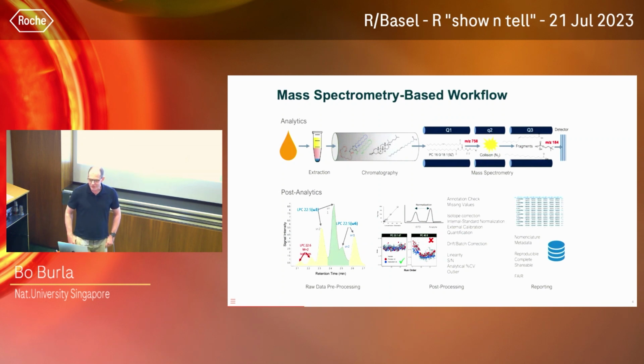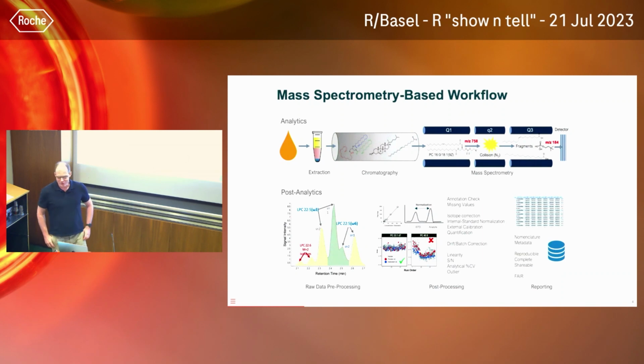We always have the situation that the biochemists or analytical chemists in our lab analyze the samples and get the peak areas with the first step, because there is a lot of software for this. But then they hand over the data to the bioinformatician, who processes it. This feedback loop until the data is processed or understood and goes back to the analyst takes a long time, and a lot of information gets lost. Often we run an analysis, and only when it's too late do we know we should have adjusted something. So the biochemist loses control over his experiment by not being able to analyze and look into the data in real time or close to real time.